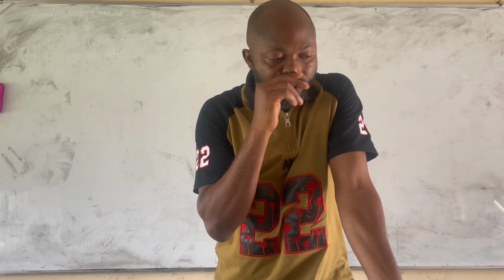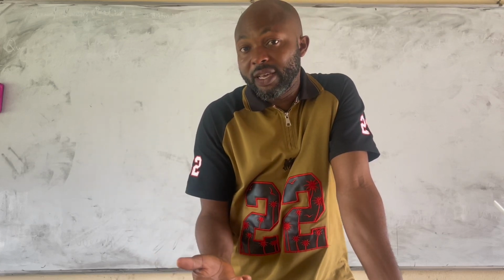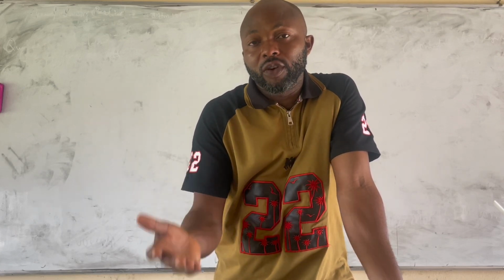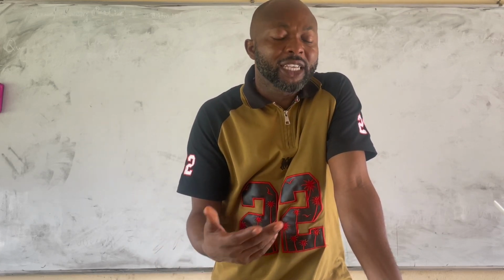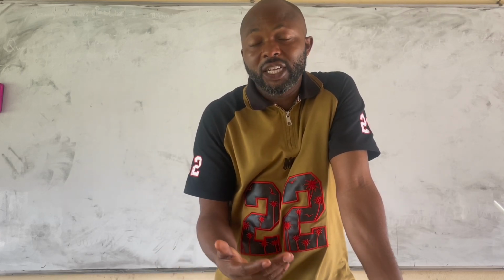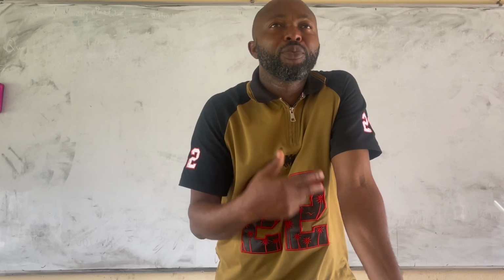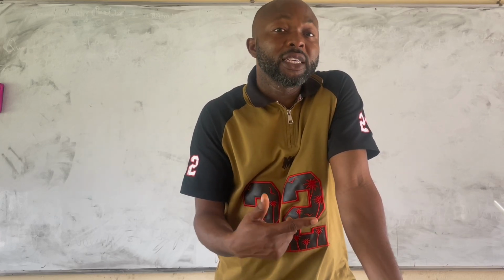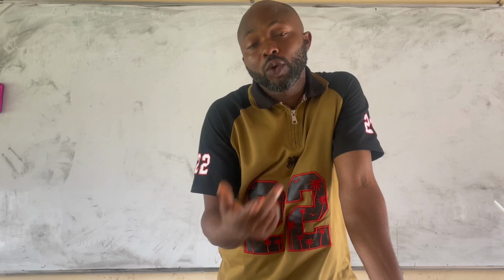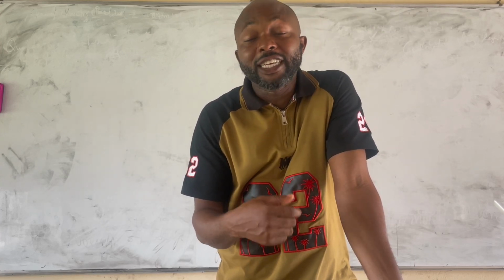I tried to explain last time when I said sample A plus sodium hydroxide. A lot of us will be asking, what is sample A? I'm trying to explain that to the best of my ability. Presumably, if sample A is sodium chloride, that sodium chloride will be taken in a test tube.